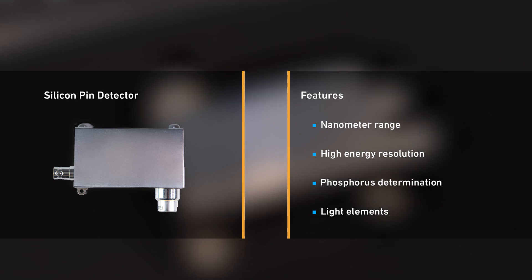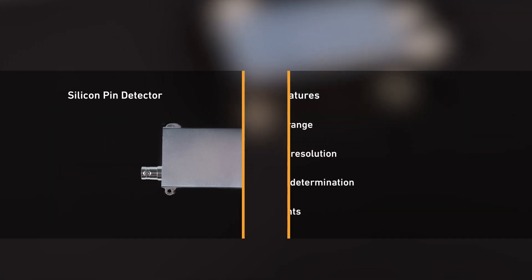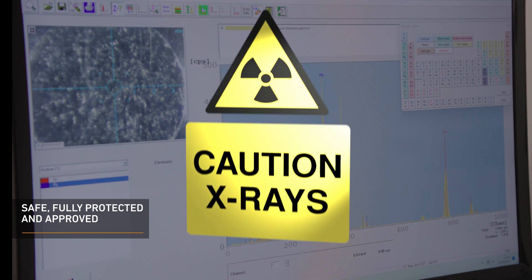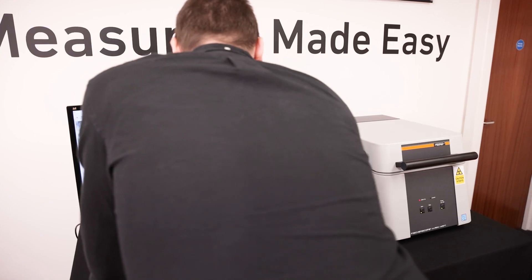It is one of the best detectors for measurement of light elements such as aluminium, silicon, phosphorus, or chlorine. The FischerScope X-Ray XAN 250 is a fully protected instrument with type approval according to current radiation protection legislation.